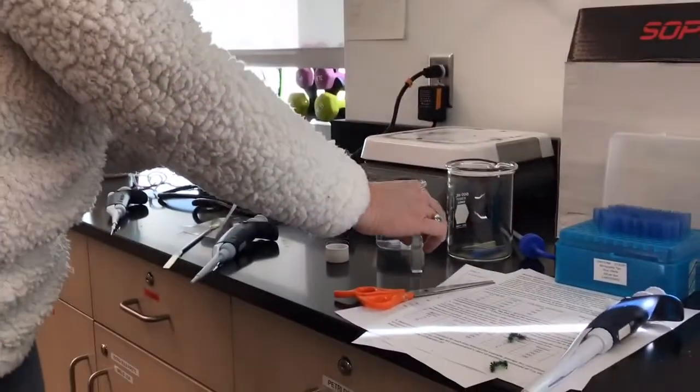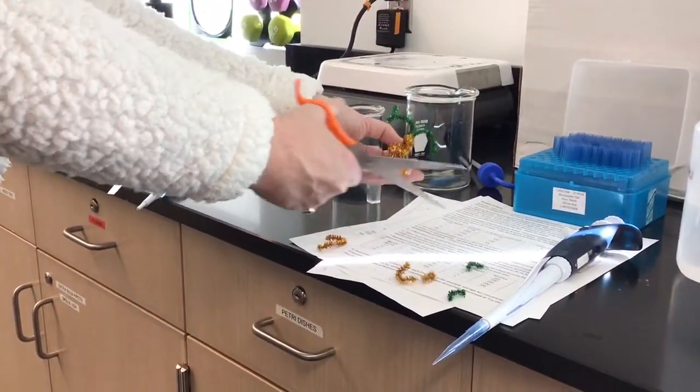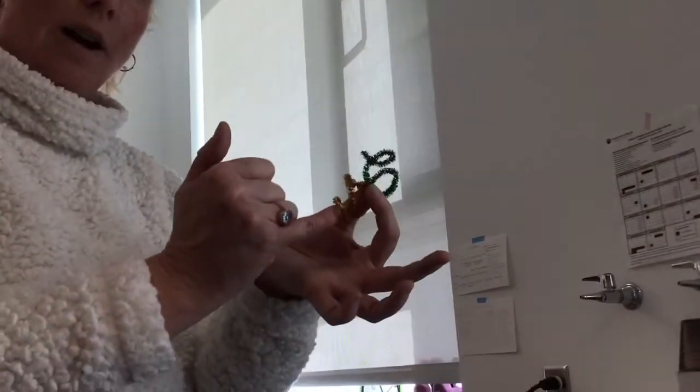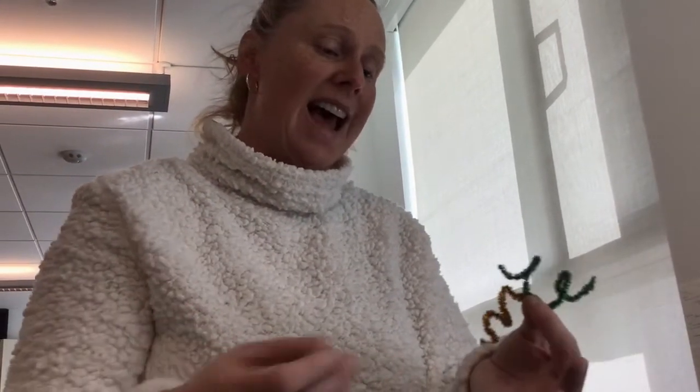So what we're going to see in a second is we've got our starch solution, and we're going to add the iodine, and it should turn this sort of bluish purple color. As the reaction occurs, as we add the enzyme, let's think about what's going to happen. The enzyme is going to start cleaving more and more over time of that amylose amylopectin. And what we should see is that the iodine can no longer, there it is on the floor, the iodine is no longer going to be held in that hole. It's actually going to dissipate out, and no longer are we going to get the bluish color. So what we're going to see, hopefully, as the progression of the experiment occurs, is that the blue color is replaced by a clearish color as amylase does its job. All right, we can go ahead and pause it for now.